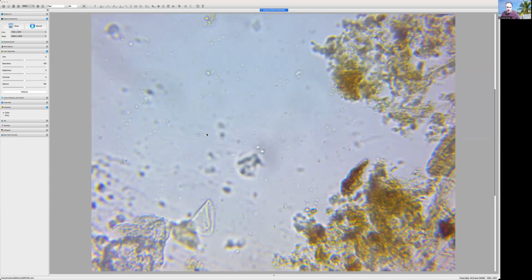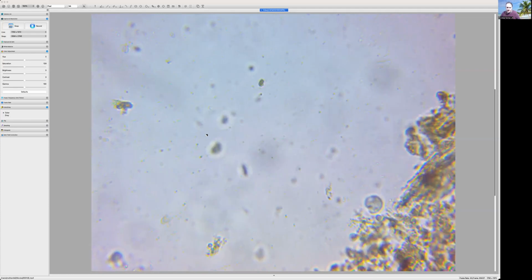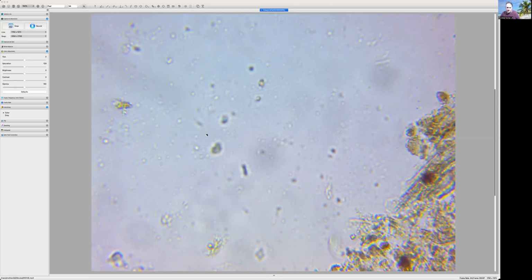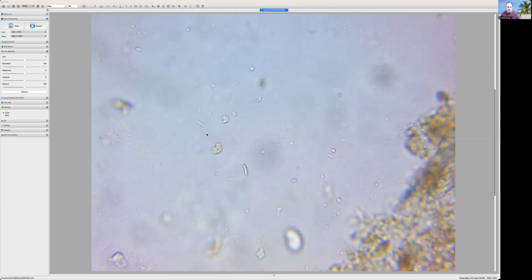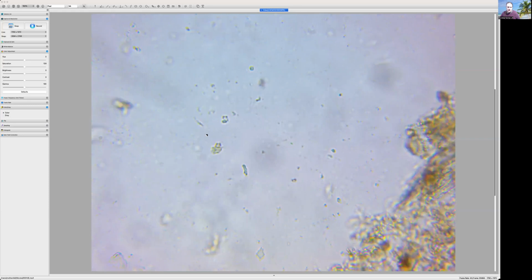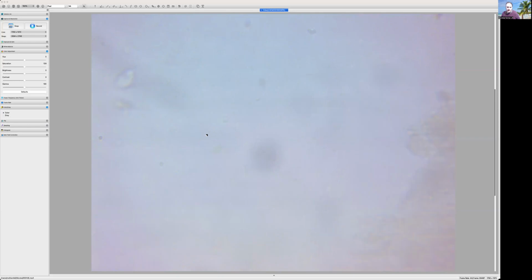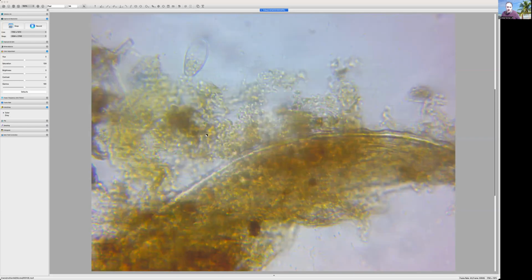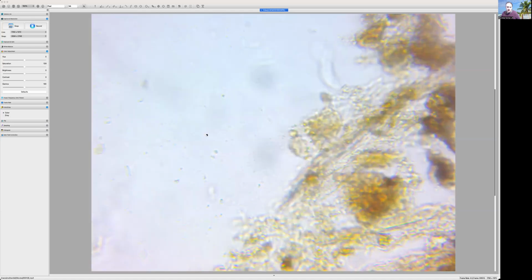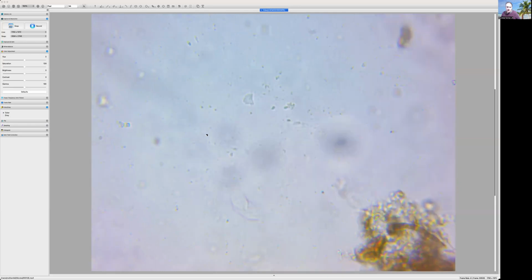Well, we don't have wild numbers of ciliates, but I'm not sure that was what she is, moving as fast as she is. Race car all over the place. That's a race car there. Okay. Yeah. Whoa. That was like a snake-like thing and moving fast.